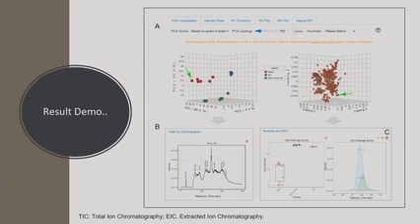For the different loadings, that means different MS features. They can click and select the features according to their importance, click them and see the real stats, and the extracted ion chromatogram (EIC) will be plotted interactively.